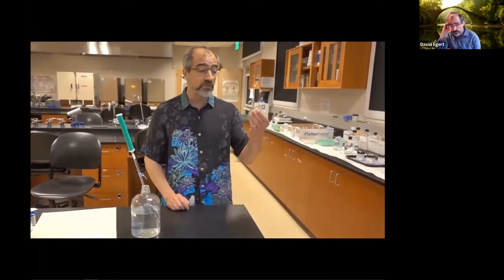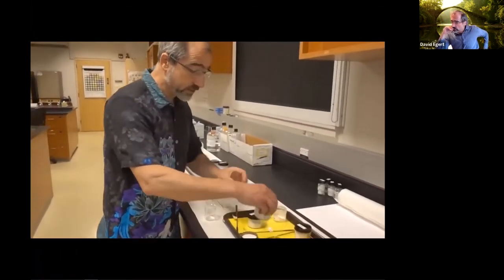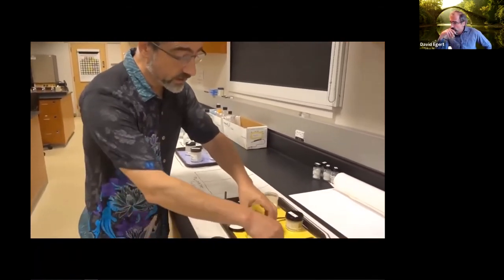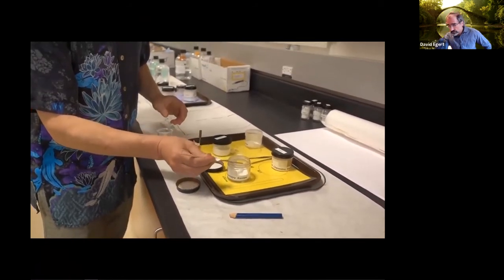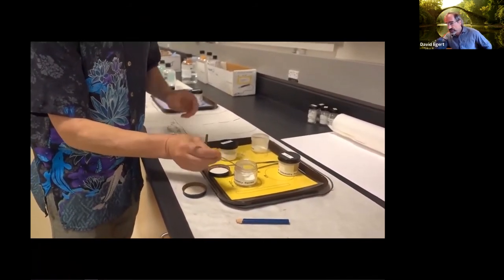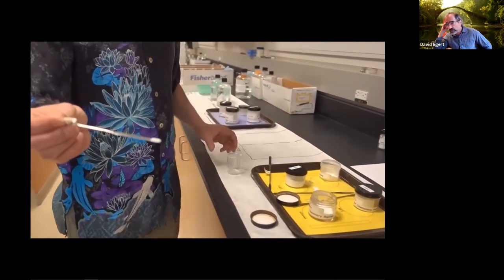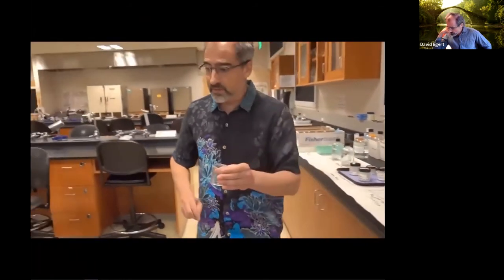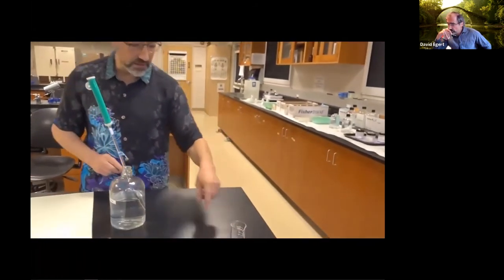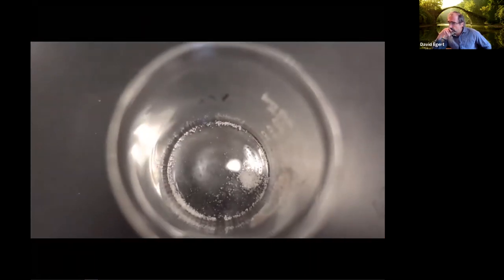So I'm going to get my little 50 ml beaker, and I'm going to put a pinch of glucose in it. I find the appropriate labeled glucose spatula, and, come on, pinch of glucose. There's my pinch of glucose, my beaker, put it in. And again, you can take a look and see there's little granulated glucose crystals in there, which again you would record in your lab notebook.